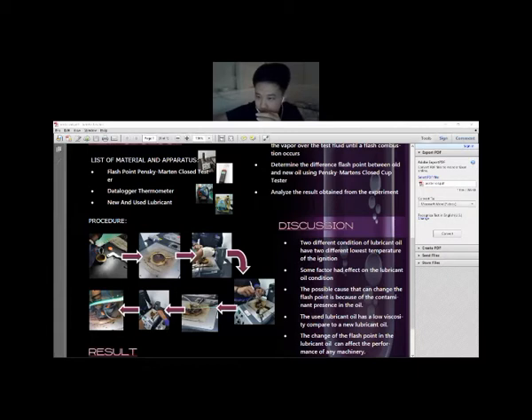The stirring device is turned on at about 250 RPM. If the test specimen is expected to have a flash point of 110 degrees Celsius or below, the used lubricating oil is heated and the ignition source is applied at every 1 degree Celsius increase when approaching its flash point.